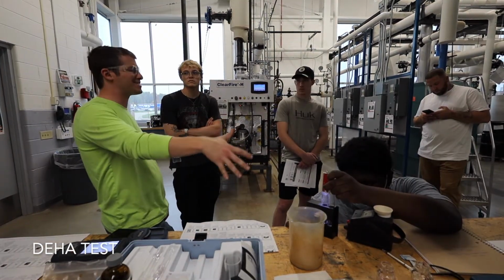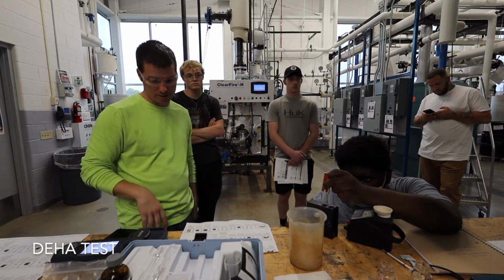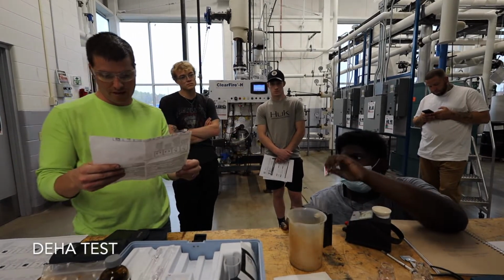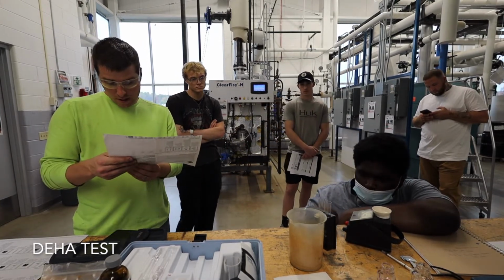Well, is it 5? Is it 10? Is it 30? Right, depending on lighting and whatever else. So I would say it's like 5 or 10. Okay. So let's go with it was 5, because you're never going to be spot on perfect with that. So, right, read the result.